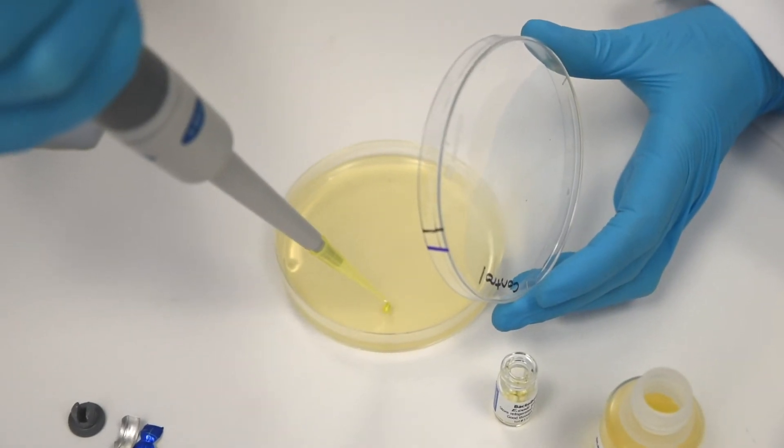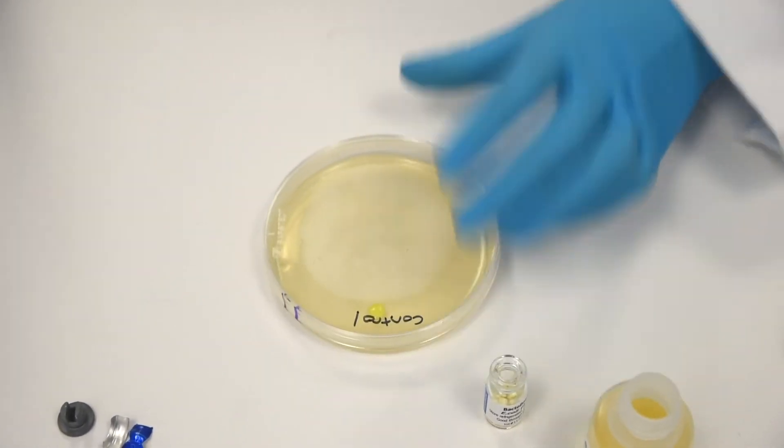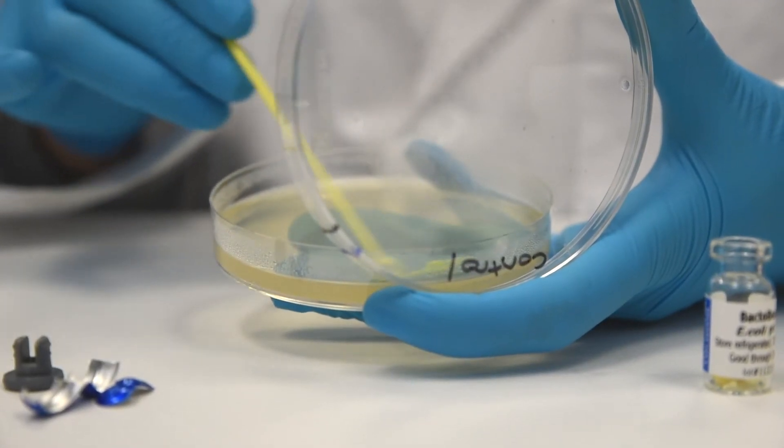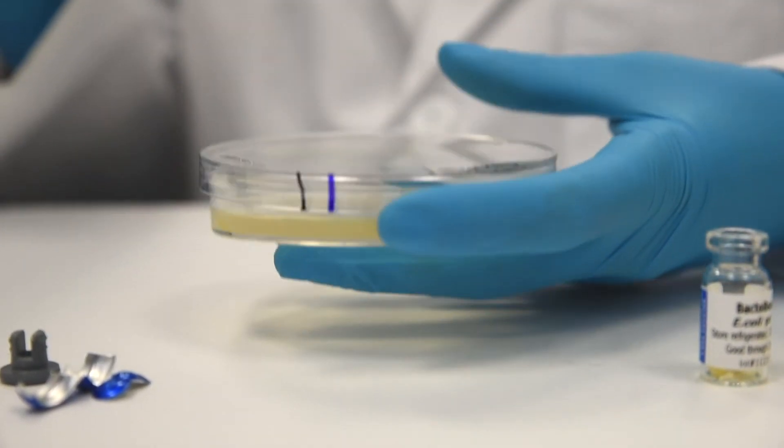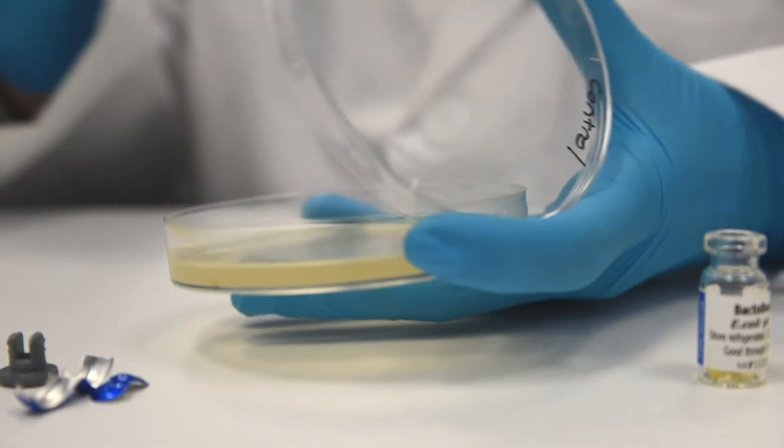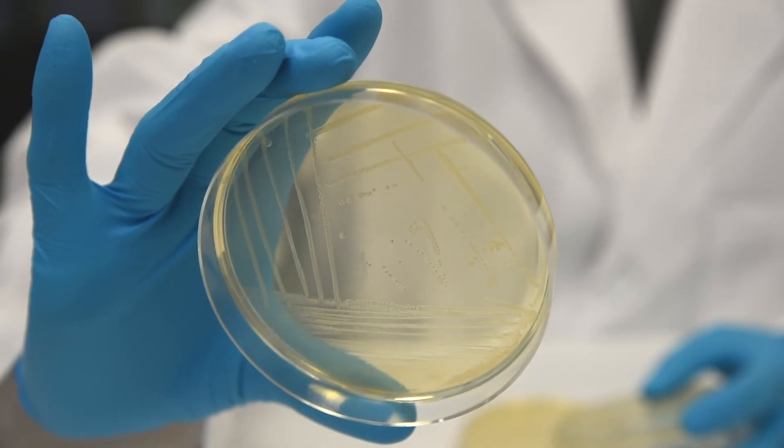These control GFP plates will be used in Module 2 if transformation is unsuccessful. They should be prepared ahead of time, incubated at 37 degrees Celsius overnight, and stored at 4 degrees Celsius until needed.